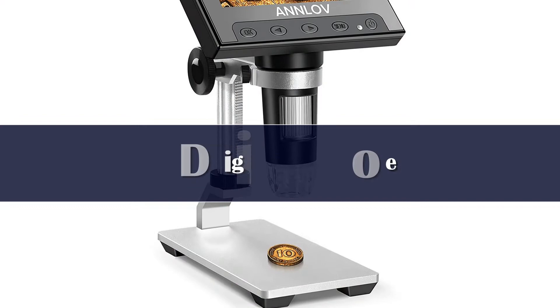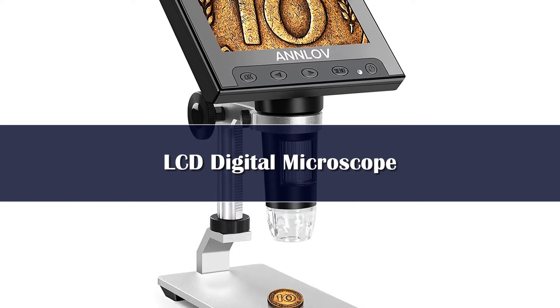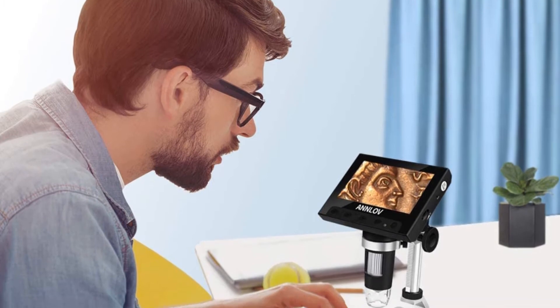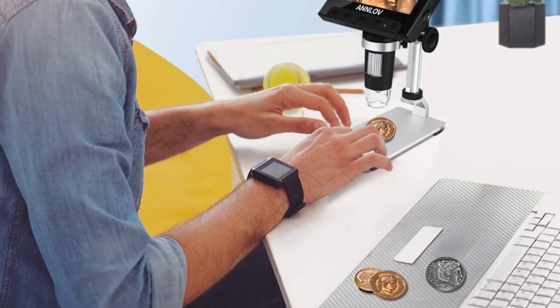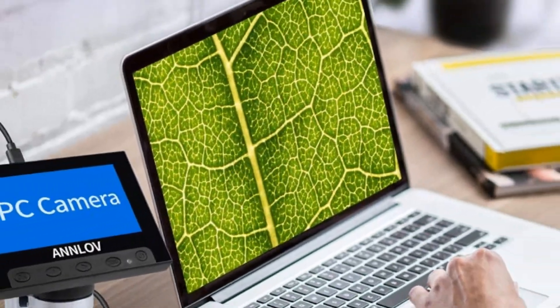Number 5: The ANN-LOV Digital Microscope provides 1000x highest magnification, which allows students, kids, and adults to view the smallest details of specimens clearly — such as plants, leaves, coins, circuit boards, insects, dissecting, trichomes, rock, stamps, skin, diamonds, soldering, biological observation, QC inspection, etc.